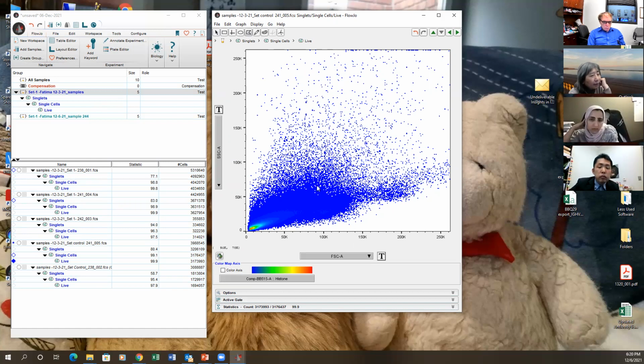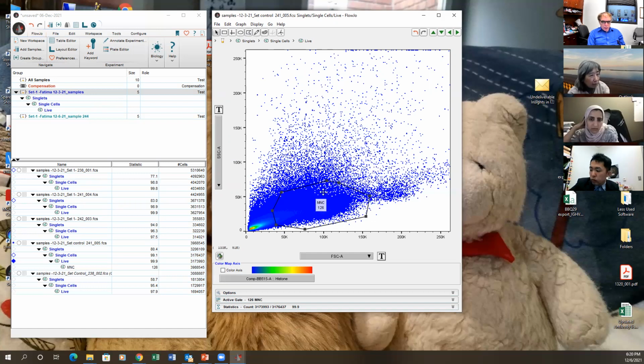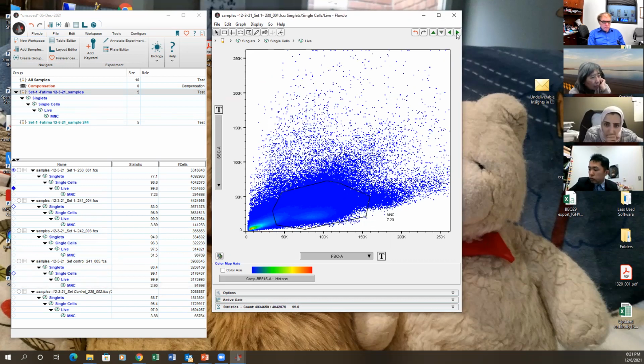So now, you can almost see the B cells there, or mononuclear cells. Wow, so lots of beads actually. So with that, you can see it there. See the little shaded thing? Yeah, so I move it to this side. So you see this.